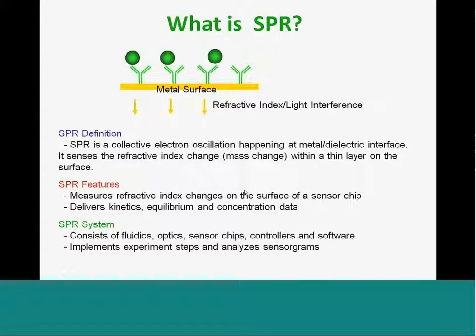So it can detect these changes on the surface of the chip, and the advantage obviously is that you can get high resolution kinetic analysis using this feature, which is exactly what we want. We know that we have these Ubiquitin-Binding domains. We don't know what the affinities are. We don't know the relative affinities and the preference for K48, and that's important for us. Knowing that could allow us to decipher function eventually.